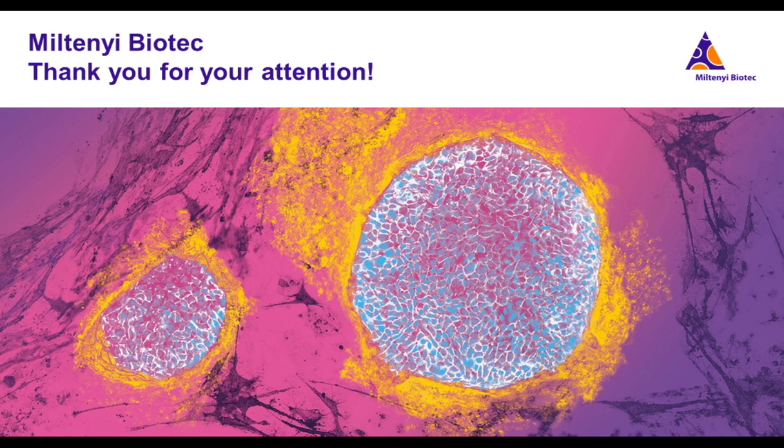Is it possible to take DIC or bright field images in parallel in each case? Unfortunately, this is not possible. The MACSima cannot generate bright field images. What is always acquired is the DAPI signal, the nuclear signal. So this is something you can always use also as a control, for example, whether the image acquisition has worked properly.